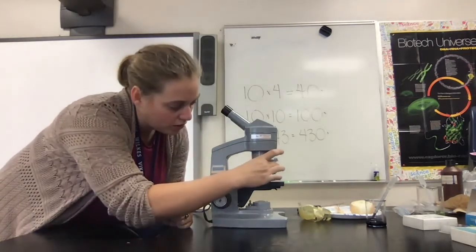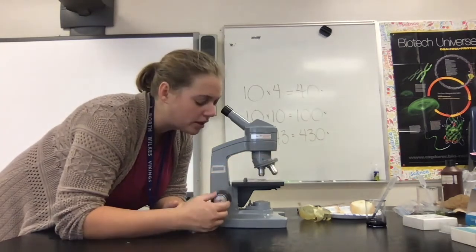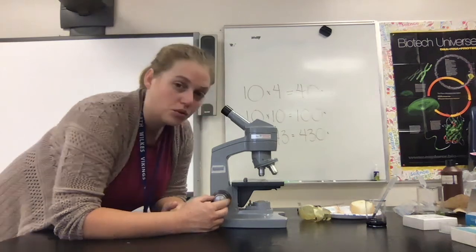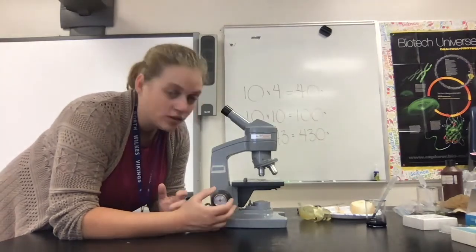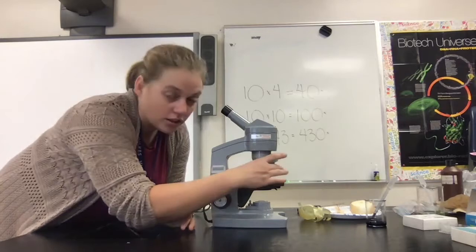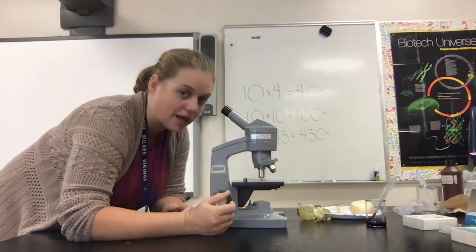Once it's centered, you're going to switch your objective to the next highest power, and we're going to look through the eyepiece and use this fine focus, this silver knob, to toggle the specimen back and forth until we're able to see detail there as well. Once you have your detail set on this power, you're going to center your specimen in your field of vision, and then we're going to switch over to the next highest power.